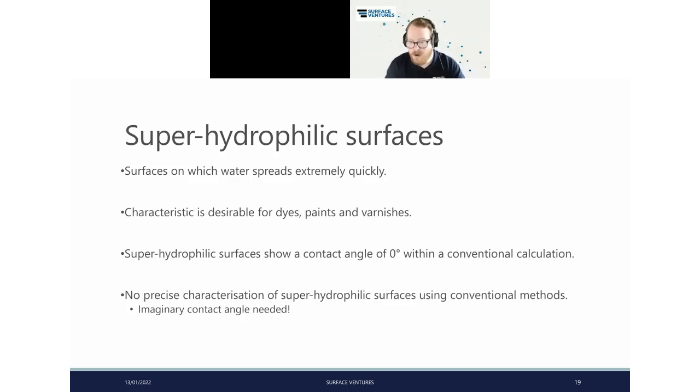Here we go. Sorry, a little comment from Amit there. Super hydrophobic materials have a contact angle of more than 150 degrees and a roll off of less than 10 degrees. Thanks, Amit. In preparing for some of this, some of the literature is a little bit fuzzy about where hydrophobic and super hydrophobic is. So I went with the widest range of angles possible, depending on what you look at. But yeah, more than 150 degrees, and obviously with a maximum of 180, because at that point it's just a droplet. It's completely non-wetted to the solid.